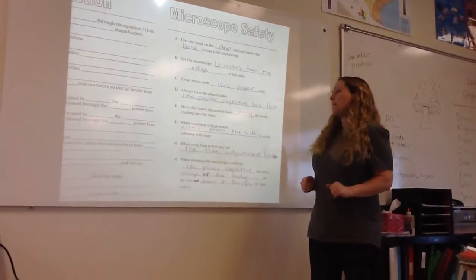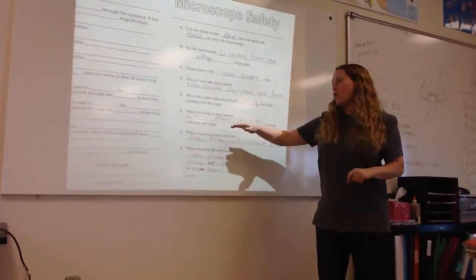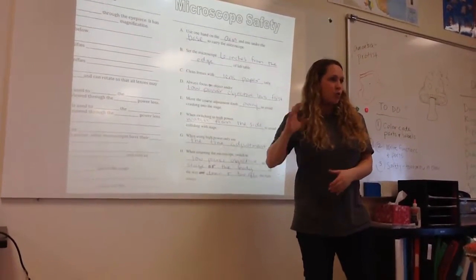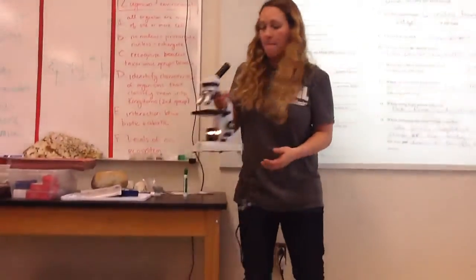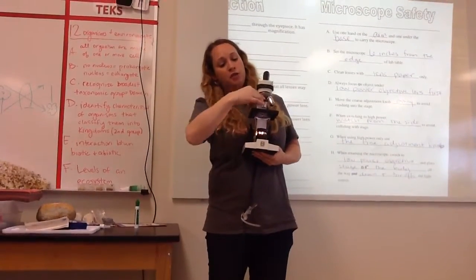Okay, so we're gonna switch to high power. You're gonna take your eye off, and you're gonna watch from the side, because the next objective lens is longer. So when I'm switching, there's a risk that it'll hit. I'm gonna show you what I'm talking about. Holding it up. Nose piece is this piece, nose piece. And you're gonna switch it to the longer one.